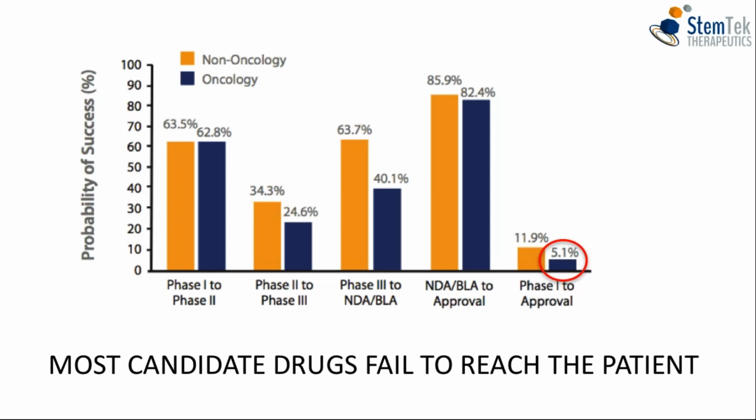If you go back to how compounds are actually selected and how decisions are made about which compounds to pursue in clinical and pharmaceutical development, we can see that almost all, if not all, drug screening campaigns identify compounds based on experiments carried out on conventional 2D monolayer cell culture.